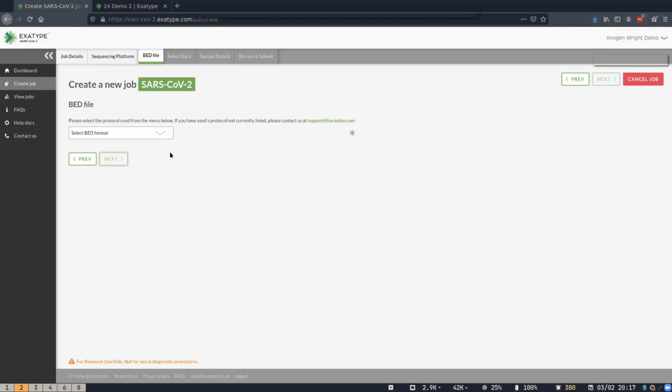The important thing about this part of the process is that in many other pipelines, it's a manual step you have to do before. And it's very important because only data in each of your DNA sequencing reads that lies within the inserts of your primer is real DNA data. The data outside that is actually part of the primer. And if you don't correctly trim off your primers, what you can get is essentially fake wild types. You can get primer data mixed in with your real data that then dilutes your variants down to a level that it's not detectable. This is often a manual step in other pipelines, but we just automate it away from you.